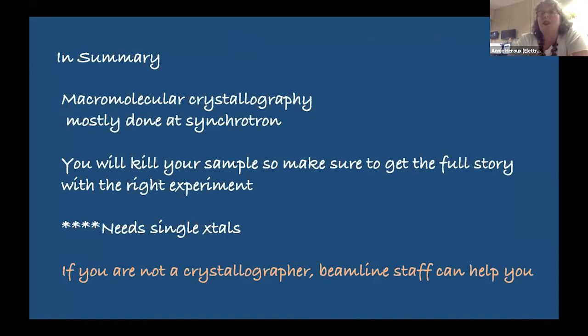You will need to go through a lot of samples very quickly, and you need to make a decision about what to do with that sample. And it's a subtle decision. You expose 0.5 seconds more per degree, or you back up your detector, or you change the wavelength.